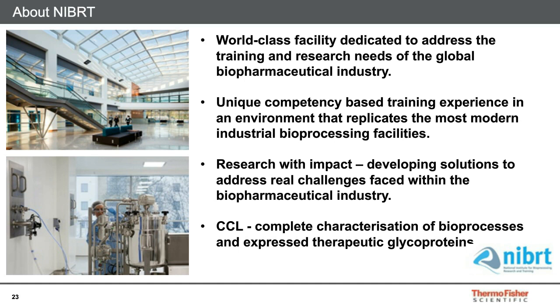As part of my work, I am involved in the development of analytical methods for characterization of biotherapeutics. Due to its ease of use and the reproducibility of the data it generates, as Mauro has nicely demonstrated in his slides, the Vanquish UHPLC is fast becoming an integral part of our product characterization toolbox for a number of reasons.